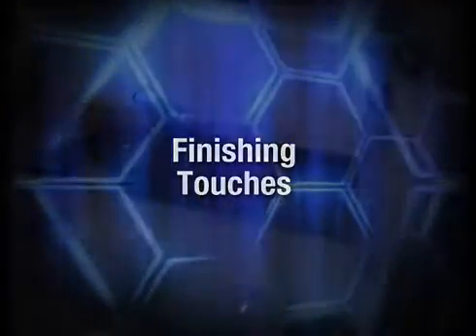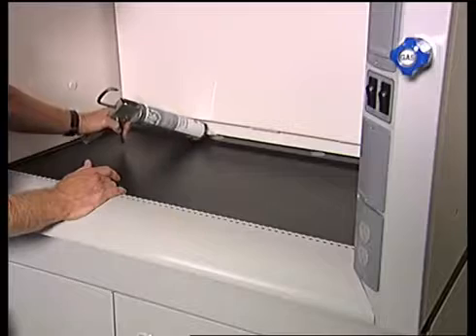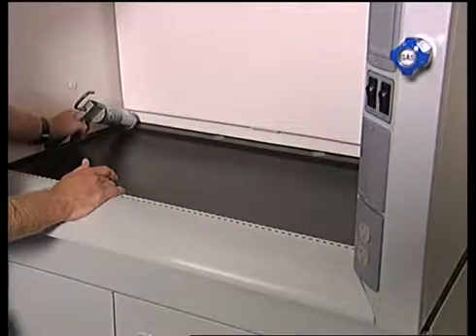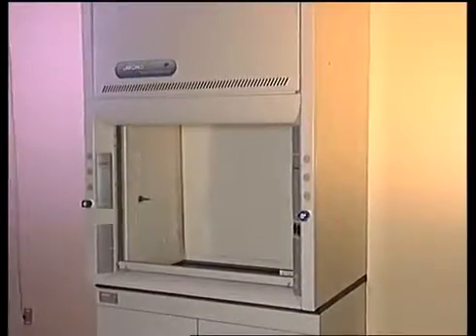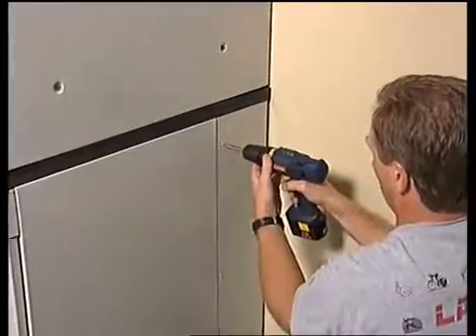The fume hood should be sealed where it meets the work surface to prevent spilled materials from collecting between them. Seal the hood by applying a bead of RTV sealant between the hood and the work surface. Once all electrical and plumbing connections are made, replace the side panels with the Phillips screws. Attach the filler panel to the panel angle with the hardware provided.